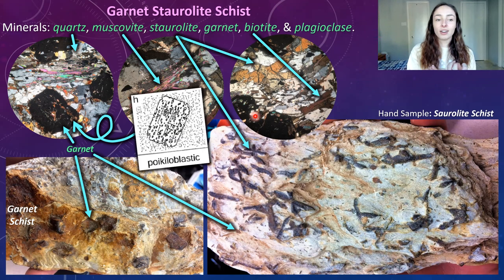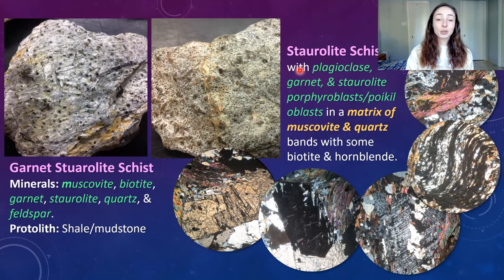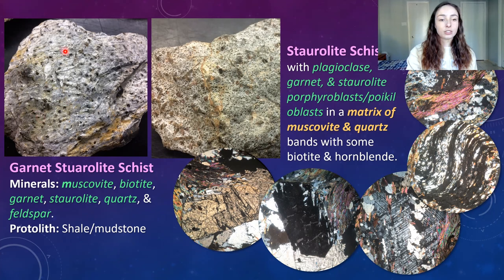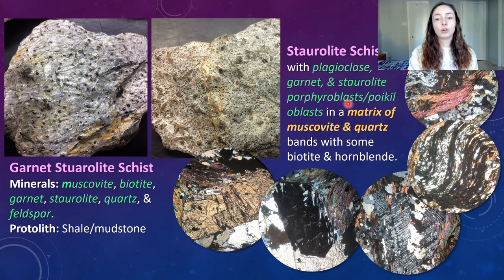Here we have two more samples of schist. The hand sample is a garnet staurolite schist — we've got little tiny garnets on the left, larger garnets and staurolite on the right. Over here to the right we've got what we're calling a staurolite schist, containing plagioclase, garnet, and staurolite porphyroblasts and poikiloblasts in a matrix of muscovite and quartz bands with some biotite and hornblende.